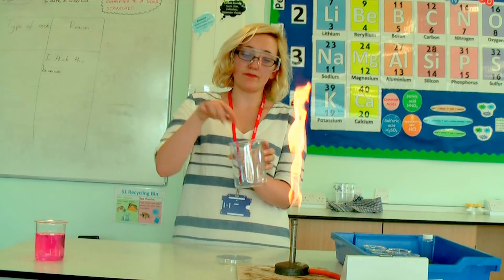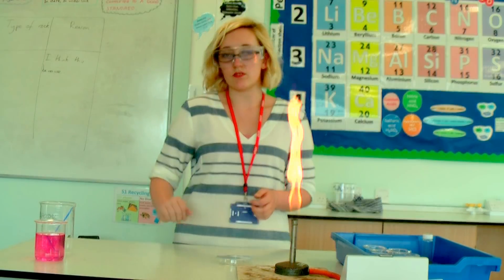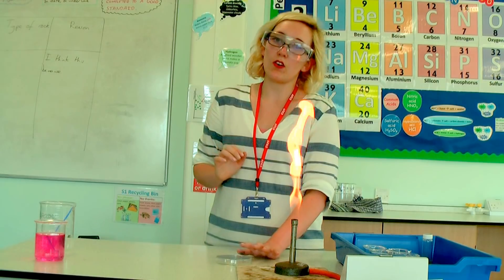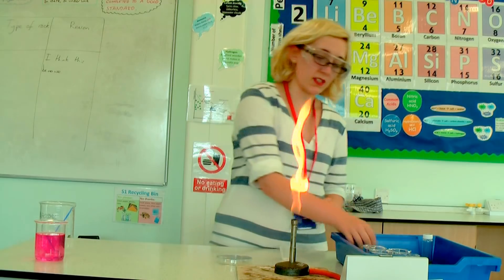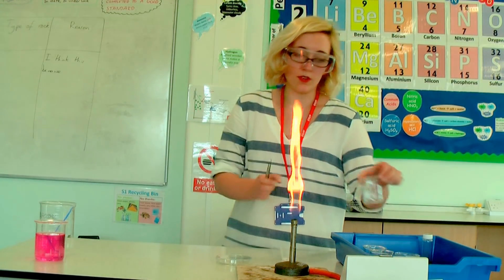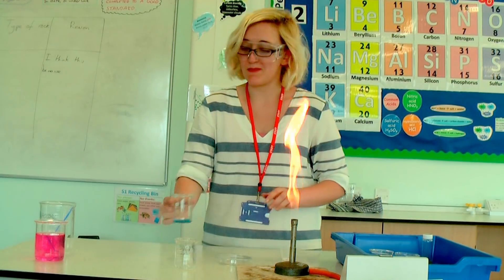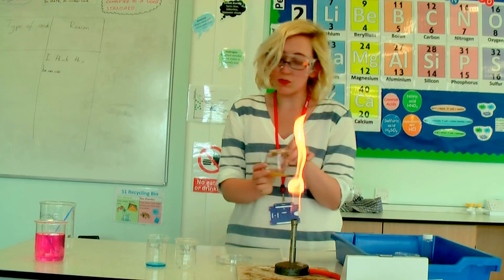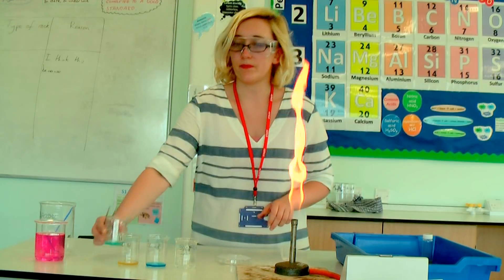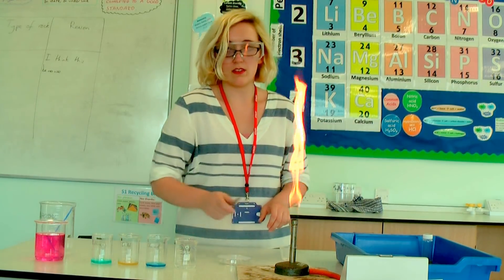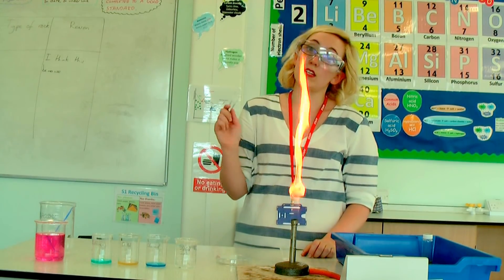Anything you're done with, just put it in a big disposal beaker so you know to throw it away later. Now I've got my E. coli on the plate. The next step is to put my little paper discs in the correct places. I've already placed my three types of antiseptic and one control into labelled beakers — Clearasil, Dettol, Listerine, and distilled water. I'm using metal forceps, which I'll sterilise before use.